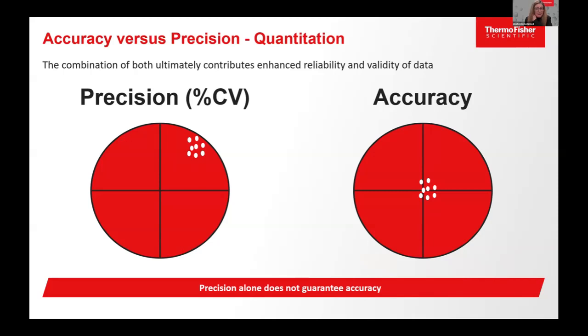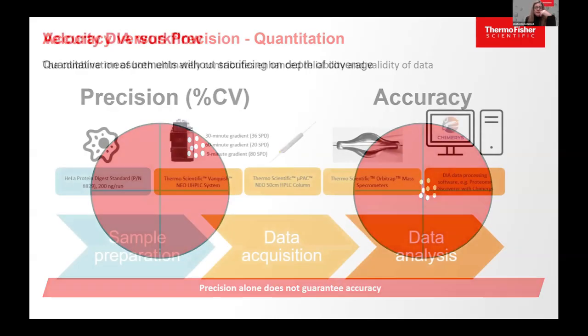I typically like to do a species mix to look at the whole proteome changes, protein profile changes, and quantification changes across the multiple species to see if my method has good quantification. The next step is measuring the statistical power of your workflow, how many samples you need to run. You can do that in a pilot of less than 50 samples that captures even a 1.1 fold change, and in a large cohort you can do that too.